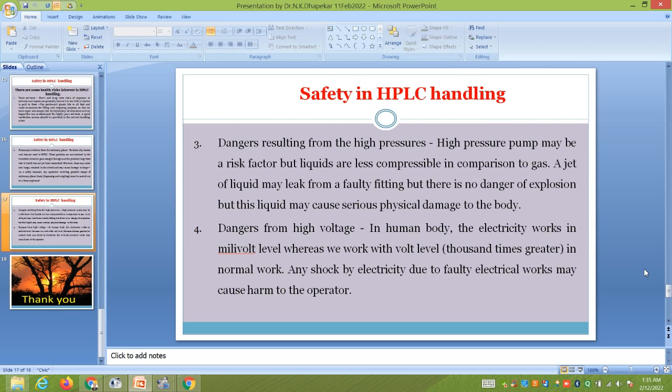So as a whole, if I would like to conclude this lecture on applications of HPLC in civil engineering, the application of HPLC is very vast, very wide in sewage quality, in water quality, in chemical admixtures, superplasticizers and cement paste. There is a lot of scope for detection of the key compounds, molecules, and the quantification of the molecules to study the impact of this on the quality of any type of mortar or concrete.